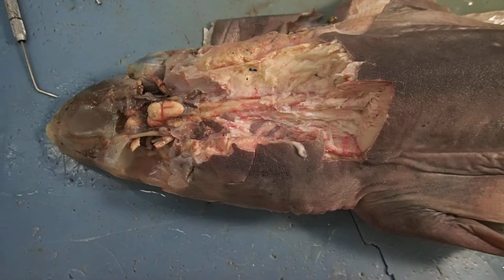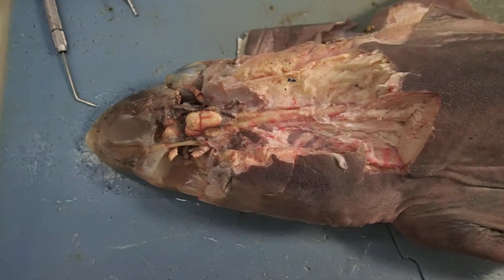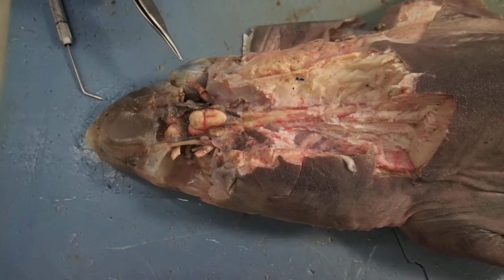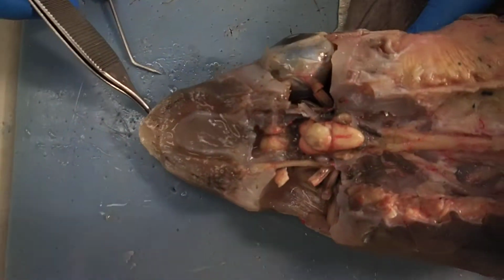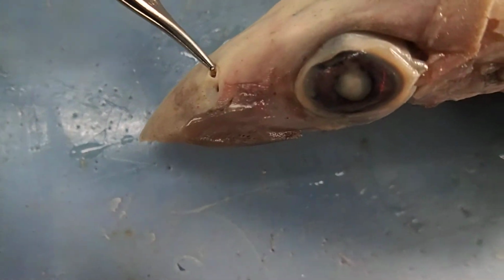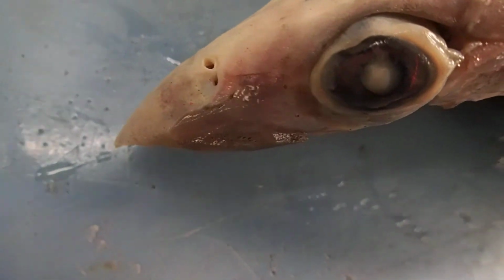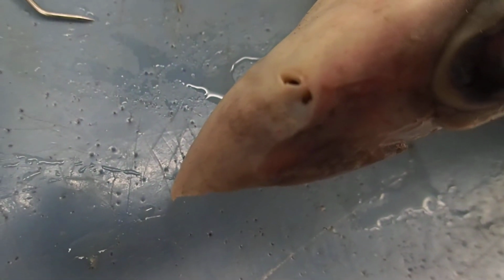All right, so with all of the specimens, what they need to be looking at is the sensory organs. We have the eyes, we have the nares, which are on the back. The nares is a little bit more complicated than we were originally probably looking at. We have both an excurrent and an incurrent hole. They need to make sure that they understand which one's the excurrent, which one's the incurrent.